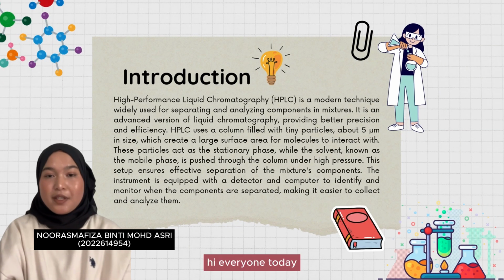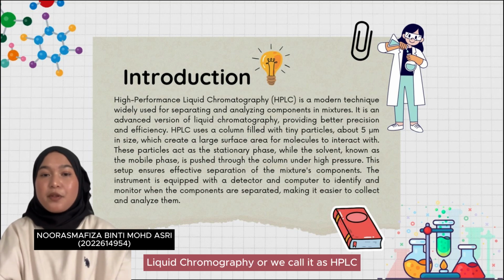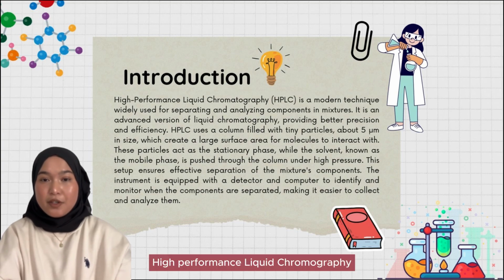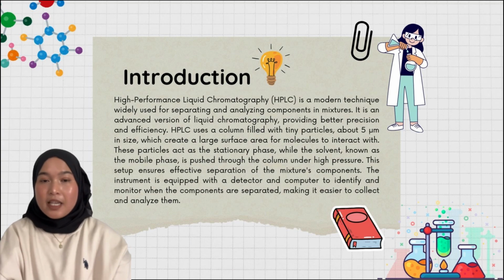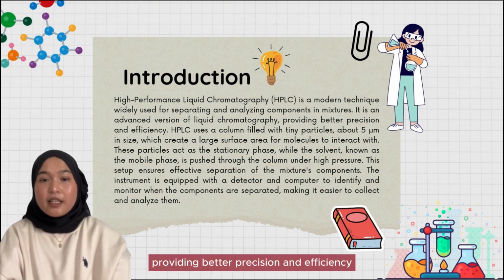Hi everyone, today I will explain what High Performance Liquid Chromatography, or HPLC, is. High Performance Liquid Chromatography (HPLC) is a modern technique widely used for separating and analyzing components in a mixture. It is an advanced version of liquid chromatography, providing greater precision and efficiency.